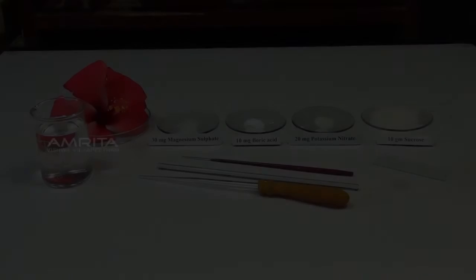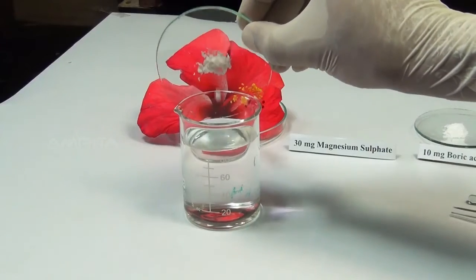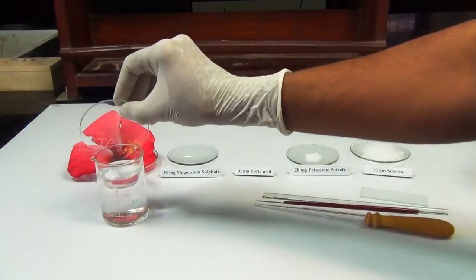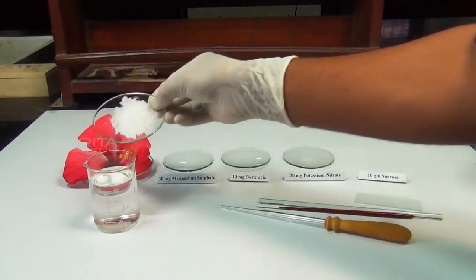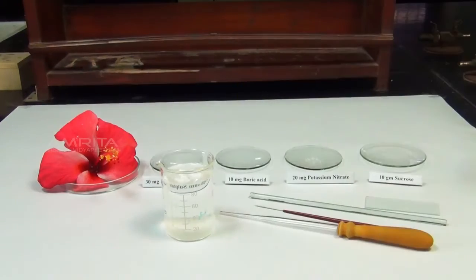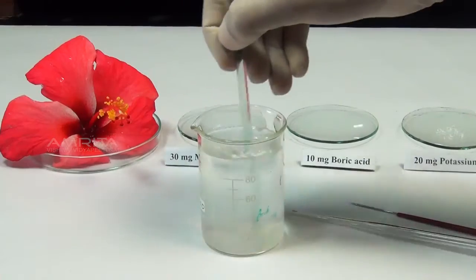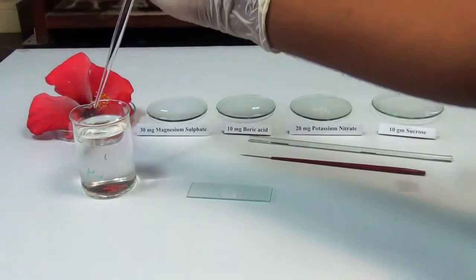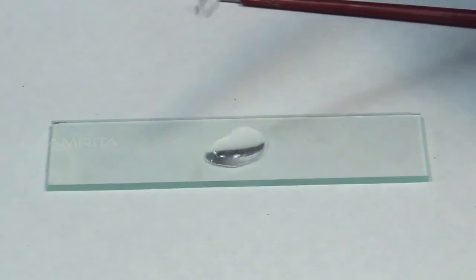Procedure: prepare the pollen germination medium by dissolving 30 mg magnesium sulfate, 10 mg boric acid, 20 mg potassium nitrate, 10 g sucrose in 100 ml of distilled water. Using a glass rod, stir the solution to mix it well. Using a dropper, take some nutrient solution and put 2 drops on a clean glass slide.